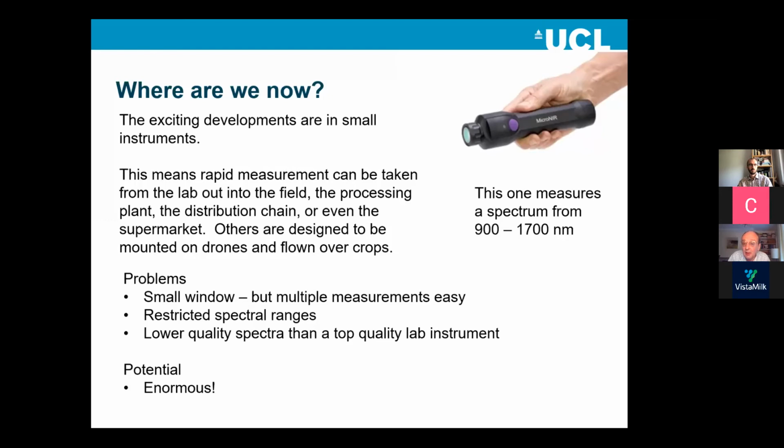But one of the problems that a lot of them do have, and you'd have to borrow one to test that, is stability. Some of them are not very stable over time. In particular, the temperature control on some isn't very good. So they would tend to heat up while they're working, and then you lose control of things and you get poor spectra. If you really want to do an evaluation, you either read a paper from somebody who's done it, or you borrow two and actually try and do some calibrations on something fairly simple and just see if it works.